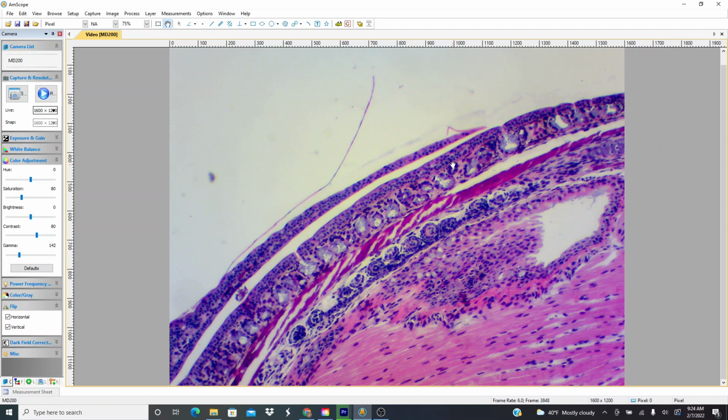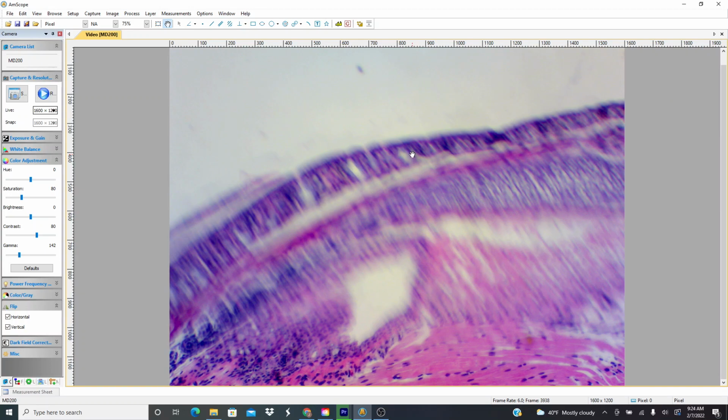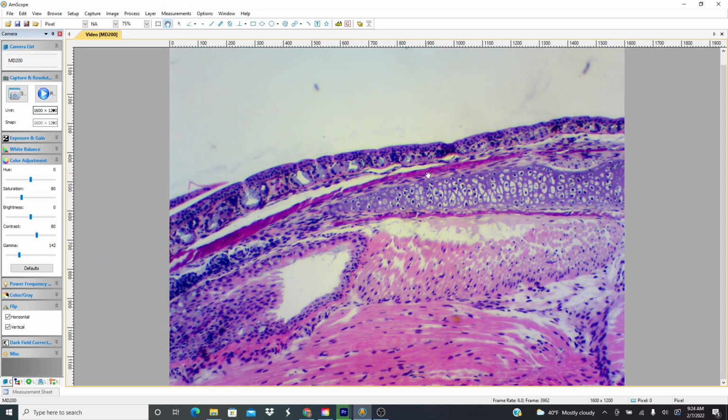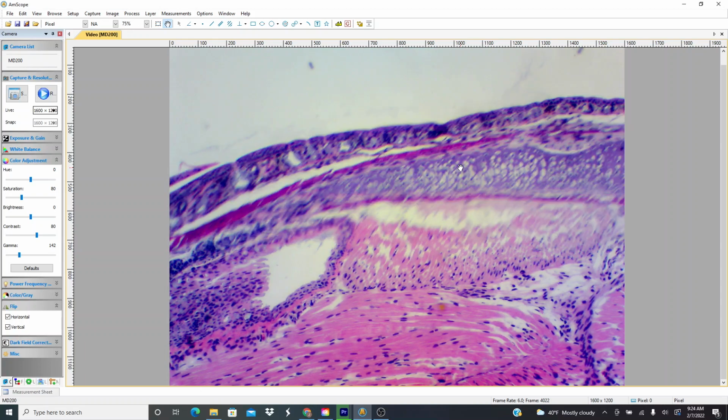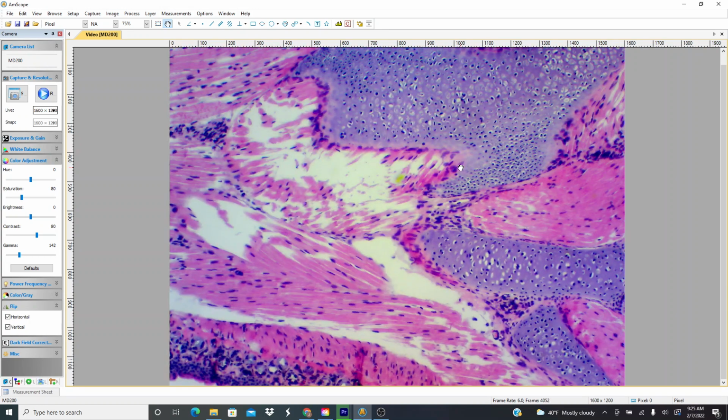You can see them here, right there, and I think that must give it this sort of mucus layer on the surface. Kind of going this way, you can see there's this tissue here. These cells with this sort of clear look, that's cartilage, and it looks to me like most of the bones in this thing are made of cartilage, and I don't see actual bone.